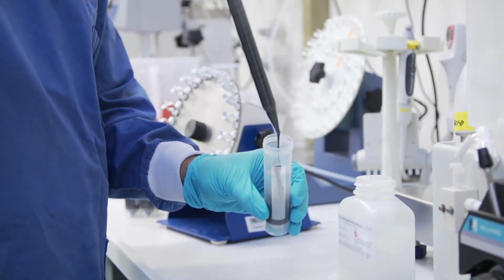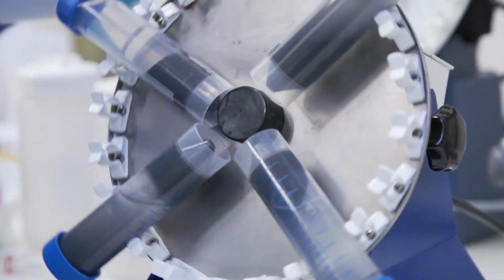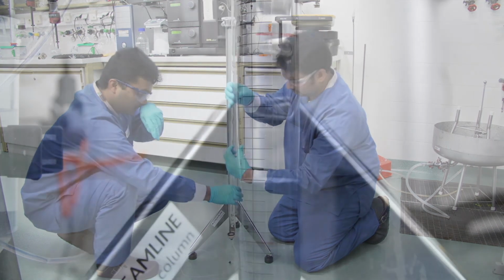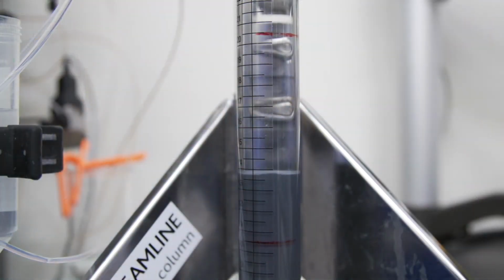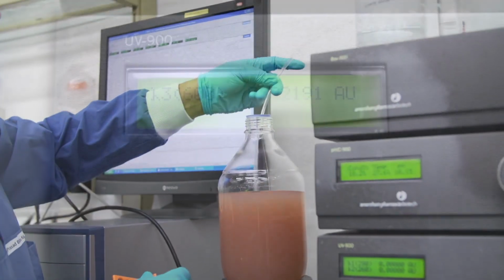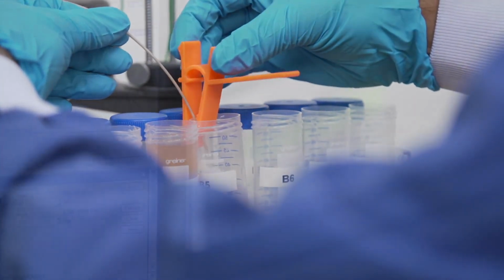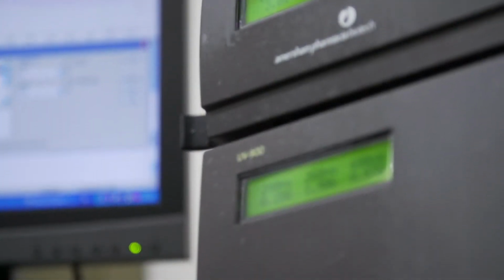Therefore, expanded bed adsorption is an ingenious approach to reducing the steps required in primary purification while simultaneously allowing for the processing of fermentation broth with extremely high titers. At first glance, expanded bed adsorption is similar to classical chromatography, but the drawbacks and requirements of traditional chromatography are mostly circumvented in EBA due to lower pressures and higher flow rates made possible by a fluidized bed.